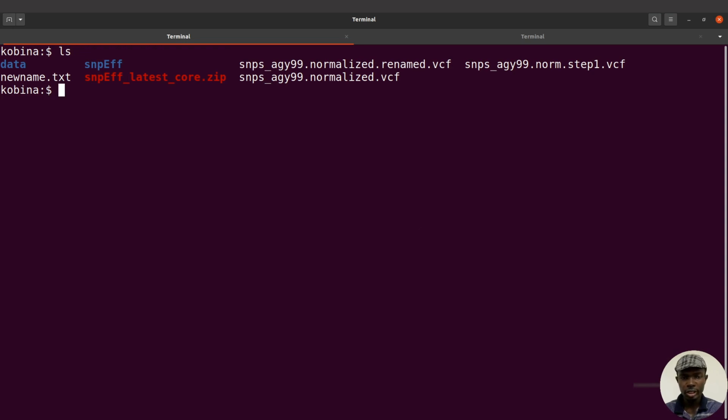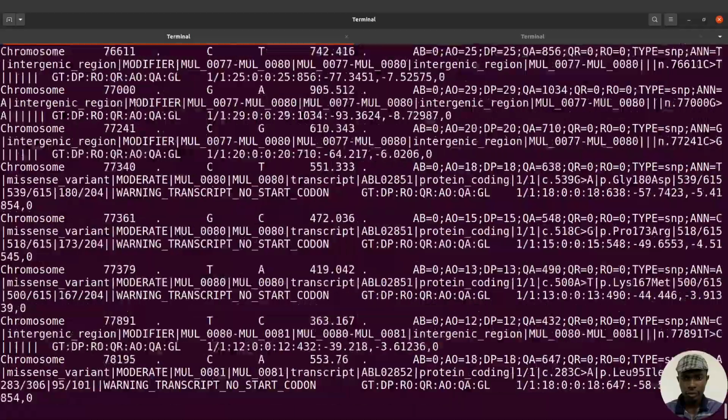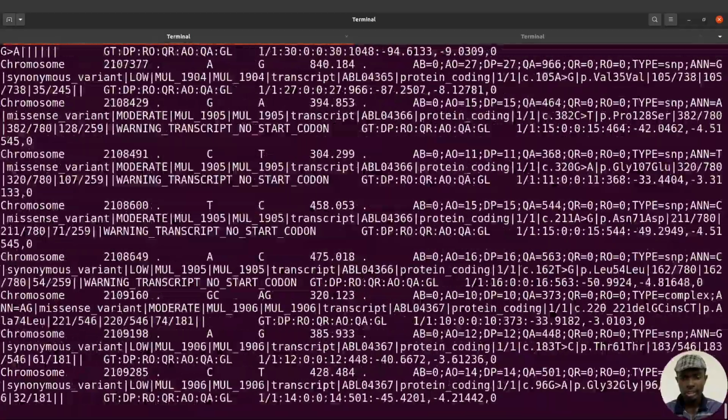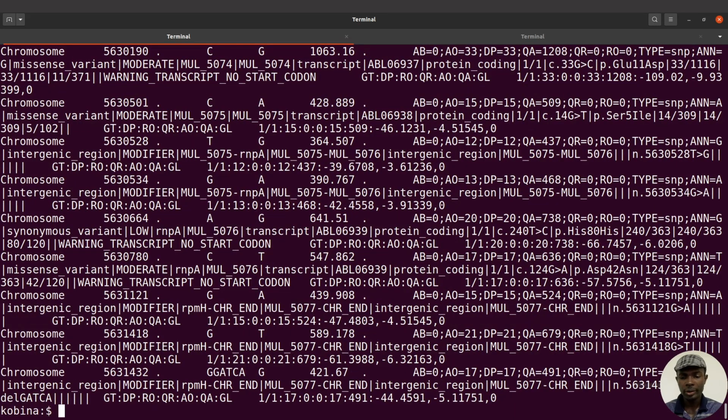Now, if you take a look at what we've done here, we did not specify any outputs. Okay, and so what's going to happen is that everything will just be displayed for us like we did see. Let me just rerun it again. There's the command, all right? So let's just rerun it again. Of course, there's the command. We can see the output being displayed for us. But what we need to do is to redirect everything to an output file.